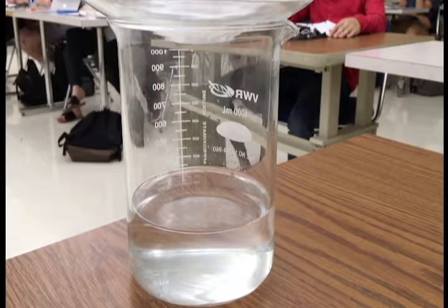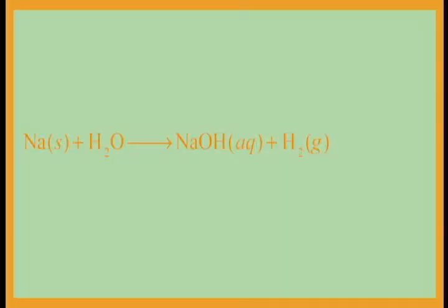The bubbles you are seeing is hydrogen gas being formed, and the resulting product besides the hydrogen gas is sodium hydroxide, which is soluble in water.